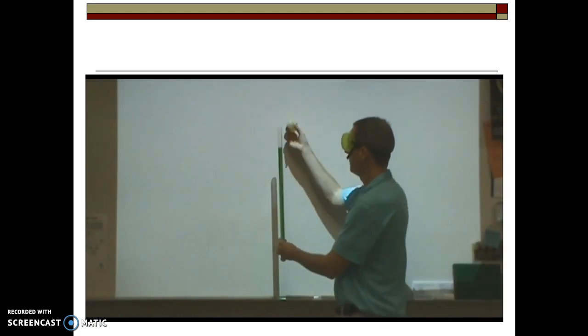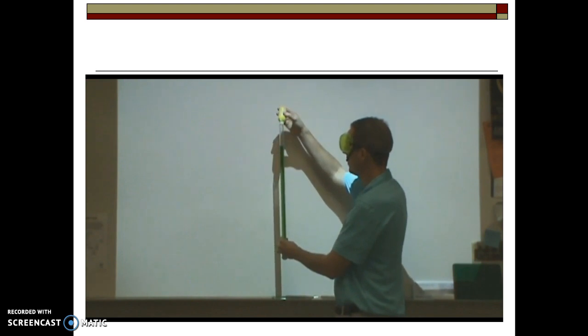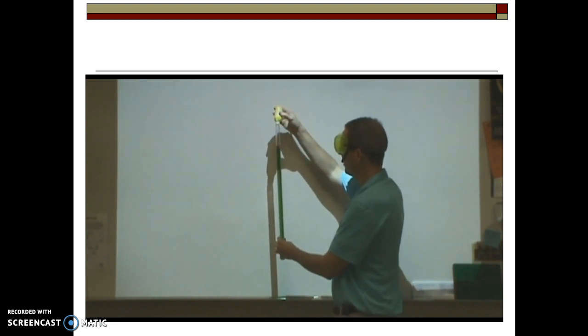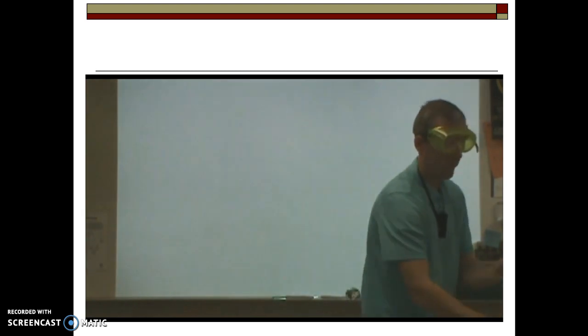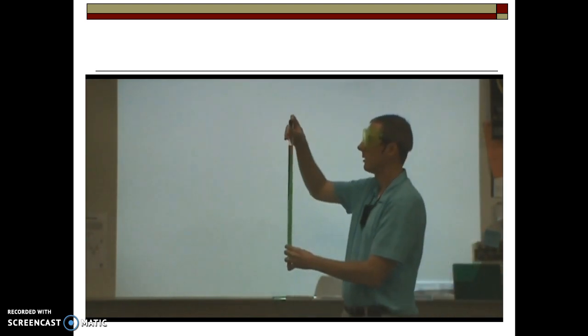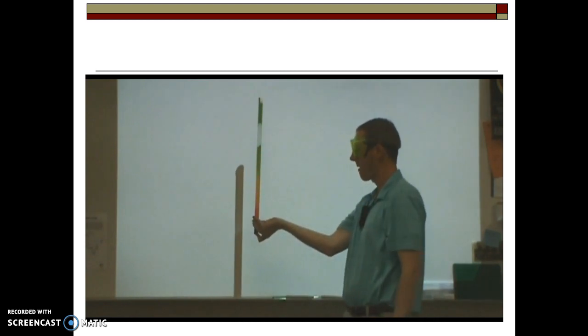Okay, so he just said he has what he's calling substance A, and he's putting four drops of substance A in that one side of the tube.